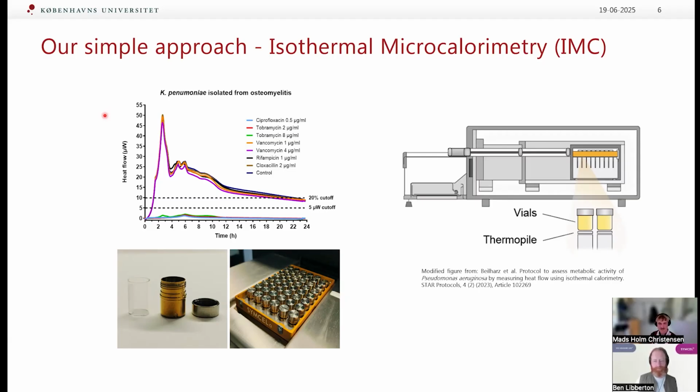Because essentially what you get is a time column and then data columns for all your samples. And just by looking at the area under the curve or the peak heat or the metabolic rate, you could take out a lot of variables from this data and use it to do some more data analysis and gain deeper insights into what you see. Yeah, it's very rich data.